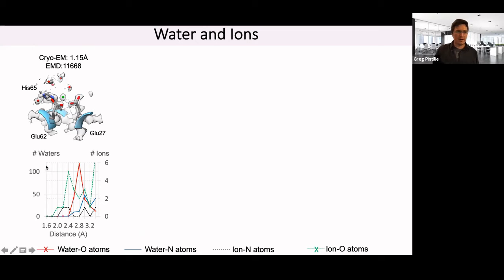So there are about, let's say, 120 water atoms. The red is the water atoms that were within 2.8 angstroms of an oxygen atom in the protein. It's interesting that you get such a sharp peak because it could have placed the water anywhere between 2.4 and 3.3, but really it found blobs that were predominantly at about 2.8 angstroms away.